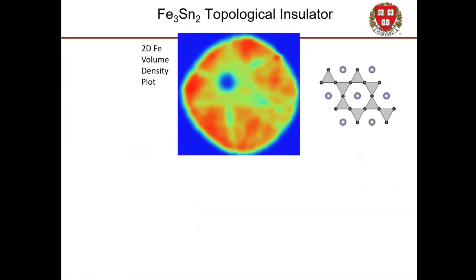Because of the presence of discrete atomic steps on the surface of our tip as it evaporates, the electric field lines actually direct atoms away from the surface in a slightly non-uniform manner, producing these lovely crystalline pole figures, very similar to what you get from diffraction methods. In this case, reproducing the triangular aspect of the Kagome lattice very nicely.